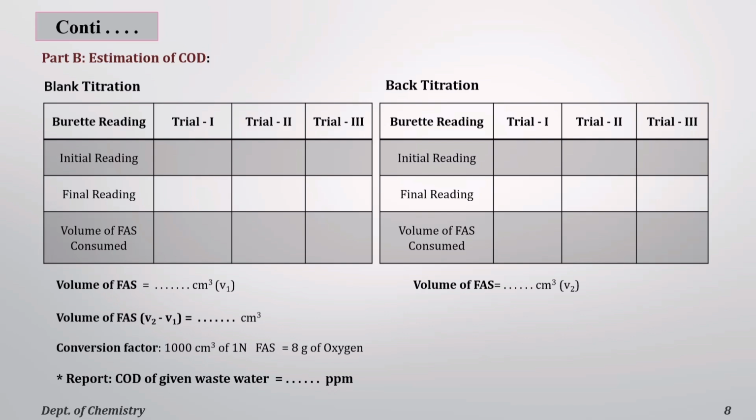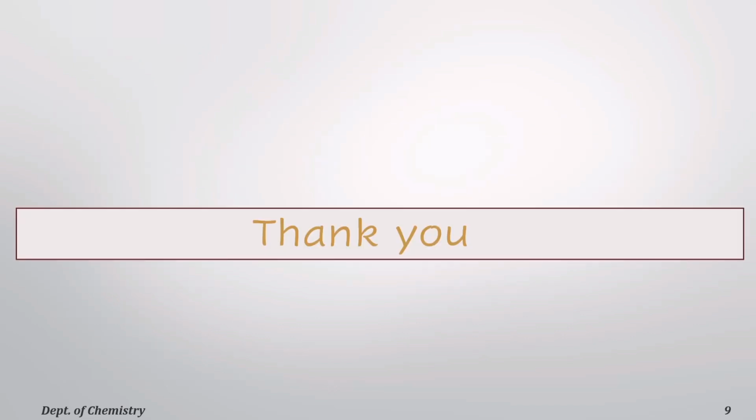So this is the conversion factor. Solving the conversion factor and arriving at the exact result, that part we will discuss in the experimental part. The result is always reported in ppm or milligrams per liter. The experimental part will be discussed next. Thank you.